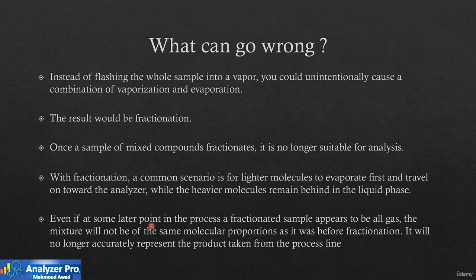Even if at some later point in the process a fractionated sample appears to be all gas, the mixture will not be of the same molecular proportions as it was before fractionation. It will no longer accurately represent the sample taken from the process line.